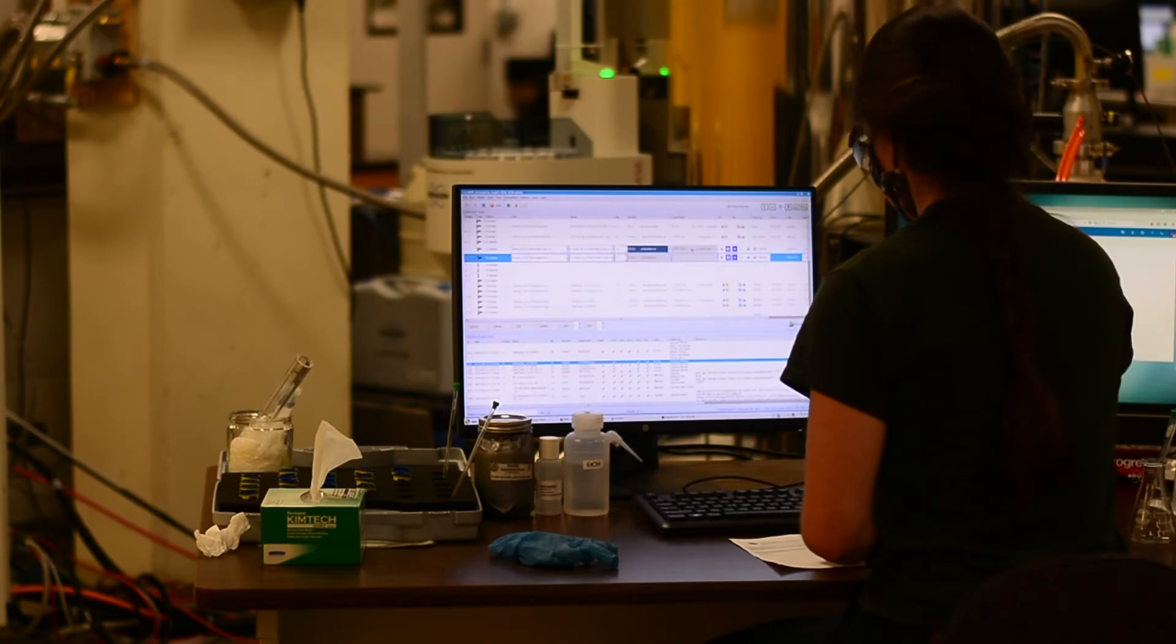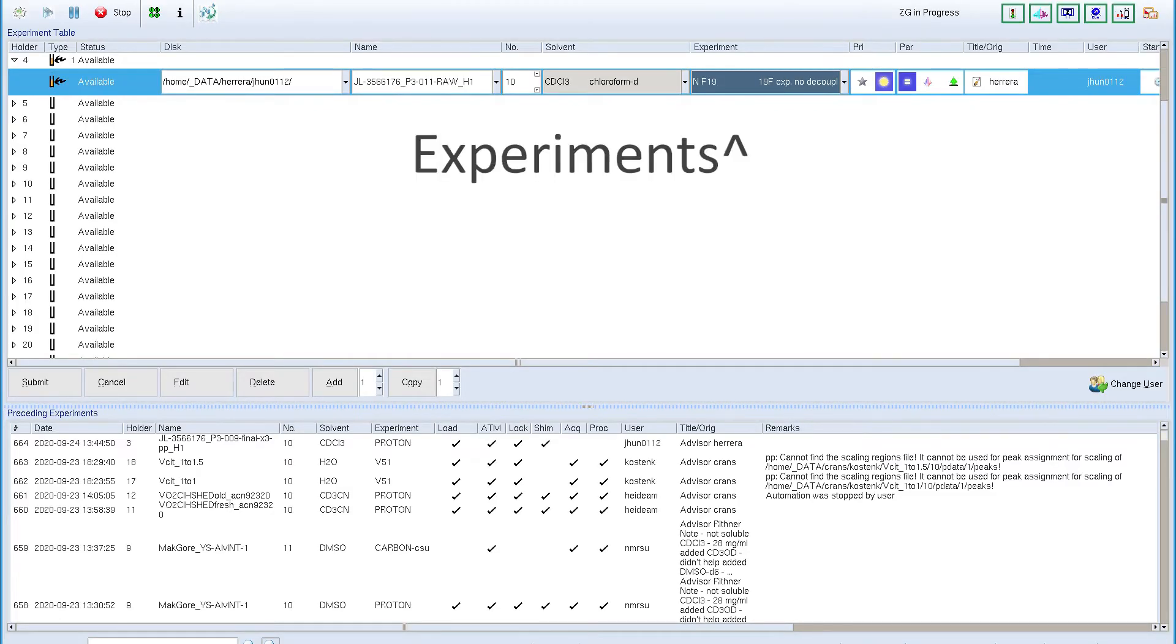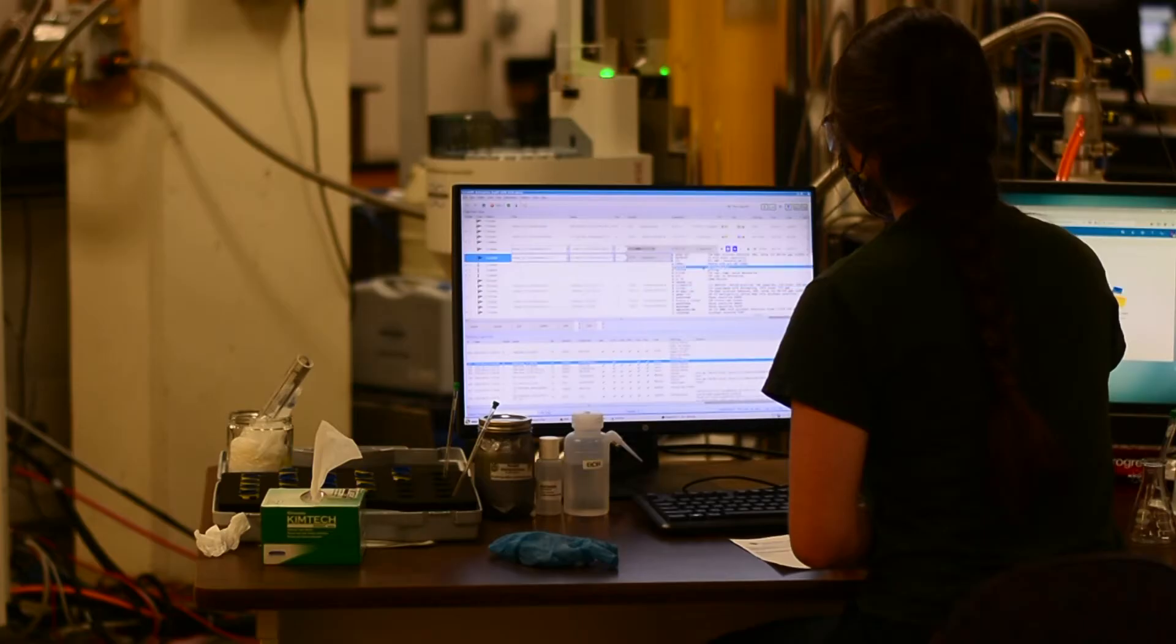Then move over to the experiment window. Click the drop down menu and select the experiment that you would like to do on your sample.